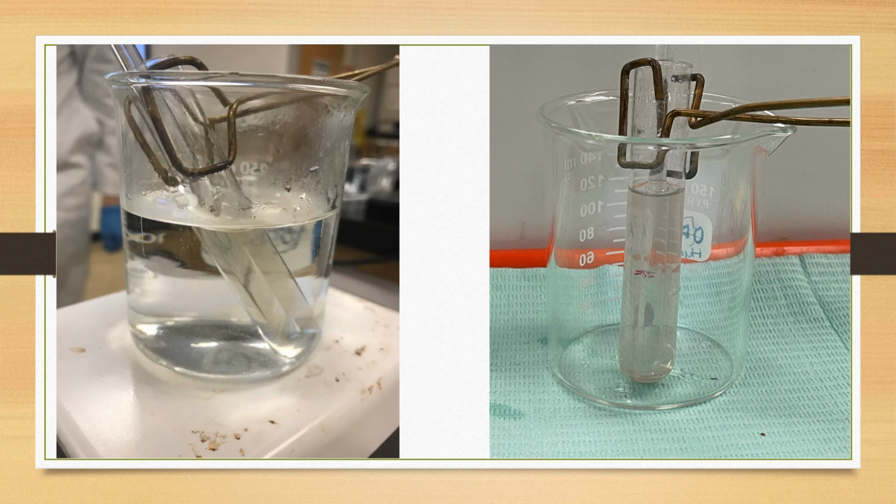As the excess sulfuric acid lowers the pH of the solution, the gelatinous precipitate will be dissolved. In the excess acid, aluminum hydroxide is converted to aluminum sulfate and water. When the reaction is complete, place the test tube into the 150 ml beaker.